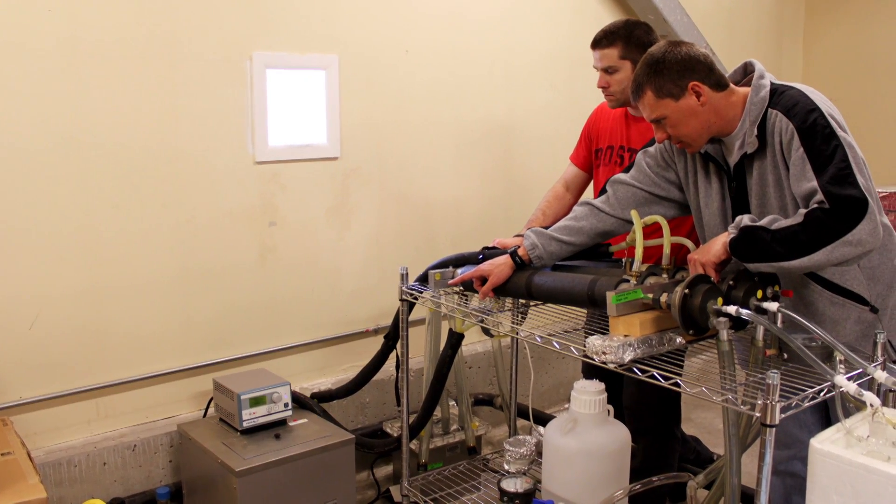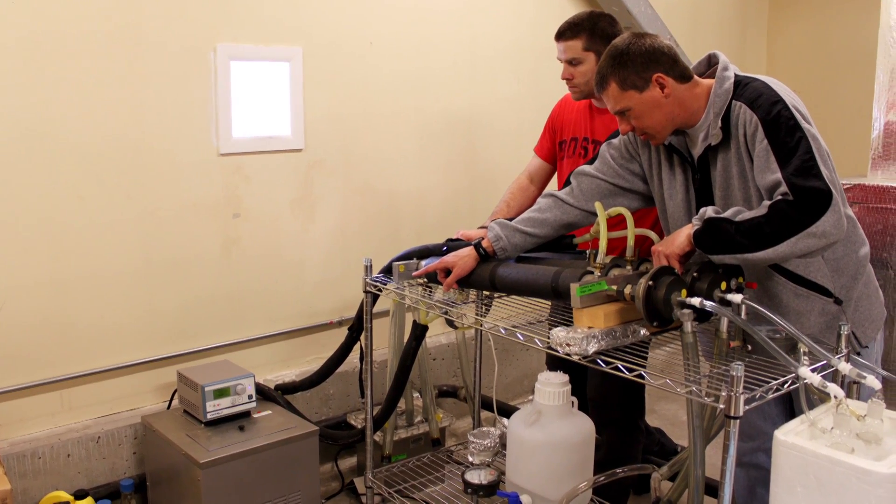The particle concentrator, pretty much everything's coming in through some tubing from outside, and the particles end up in these three different biosamplers. I have three parallel lines, all combined about 110 liters per minute. In these biosamplers, all the particles are being deposited into this ultra-pure water.